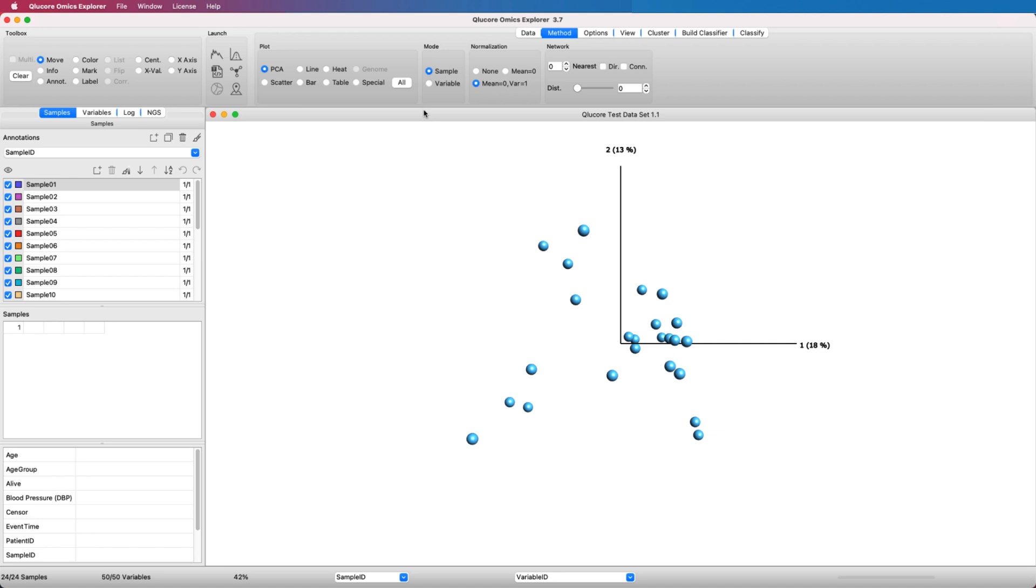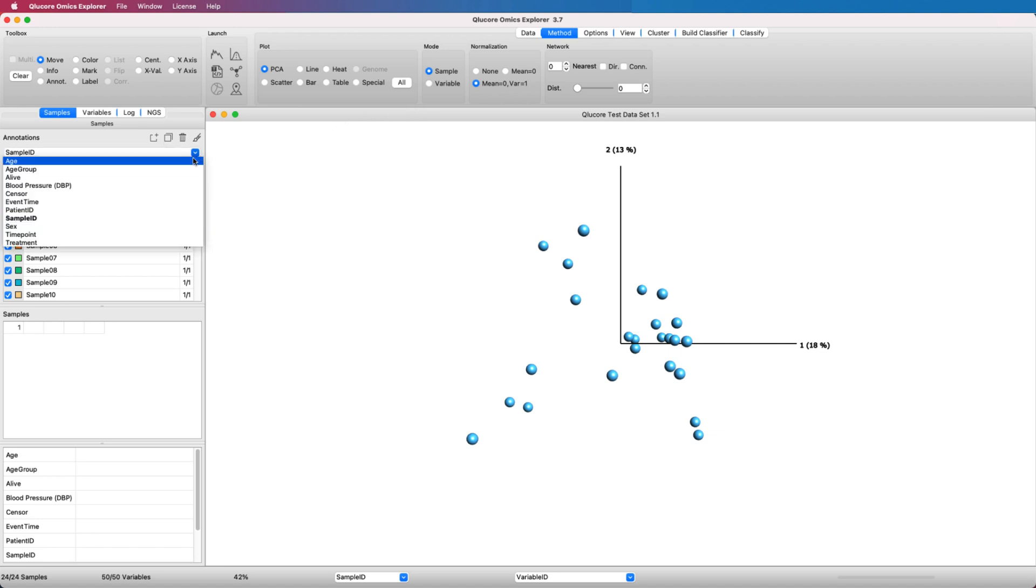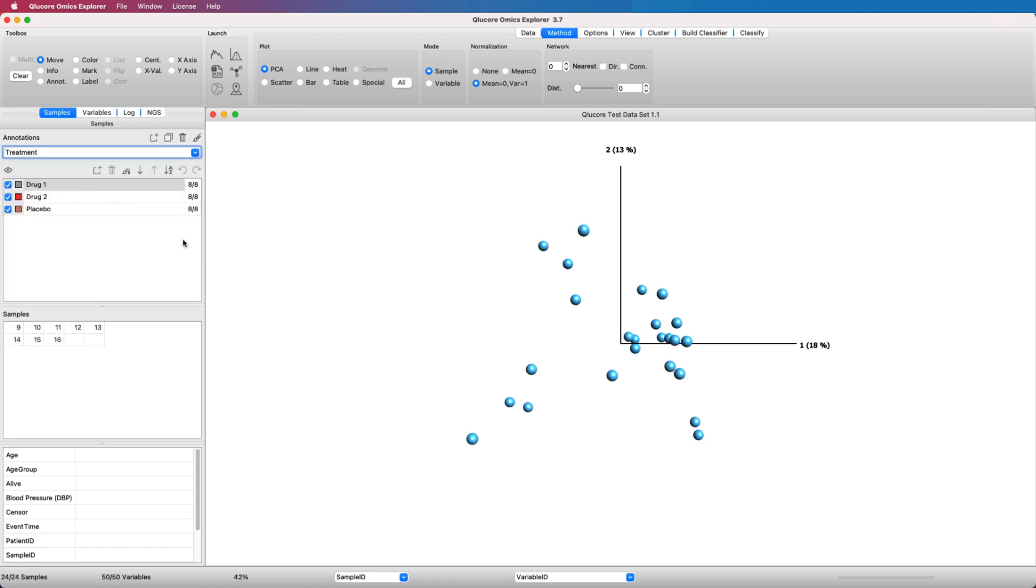Observe in the Sample tab that there is an annotation called Treatment. It has three values: placebo, drug 1, and drug 2.